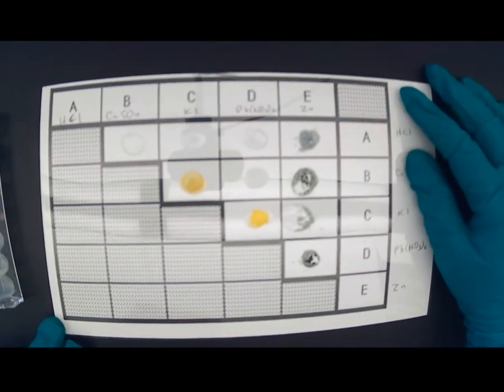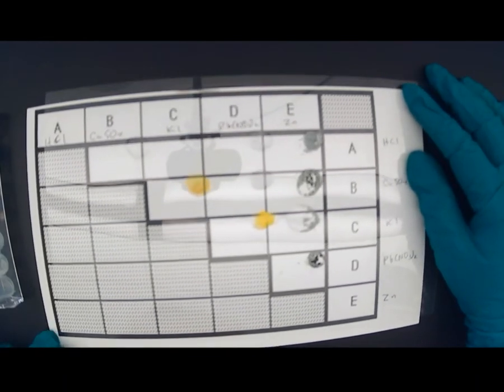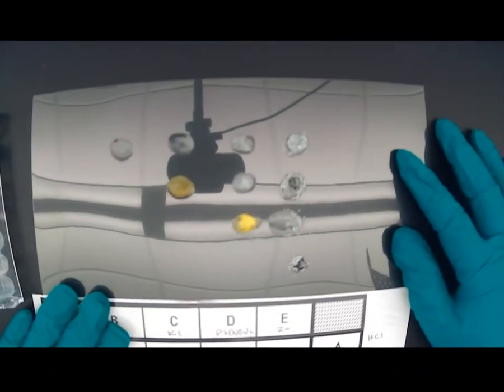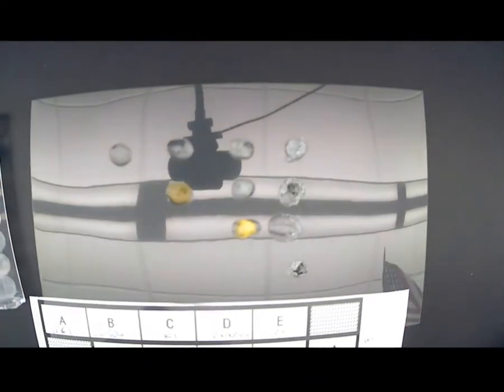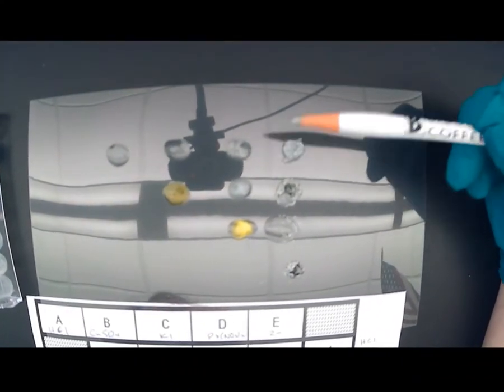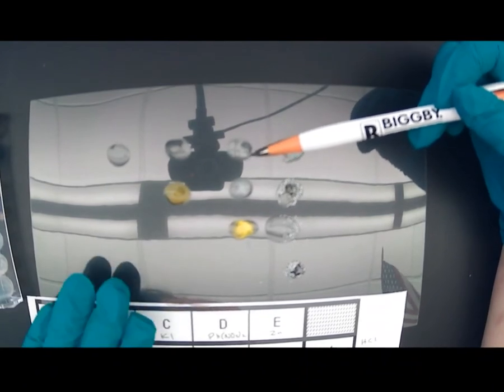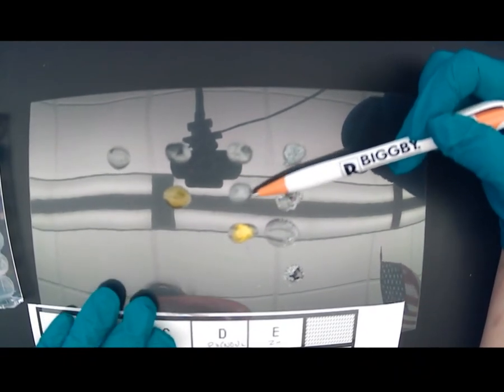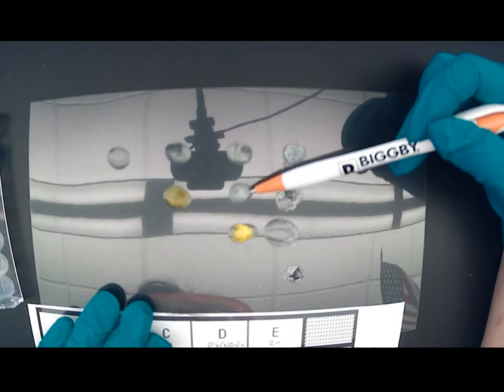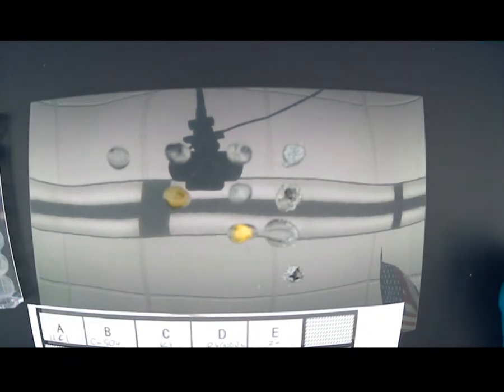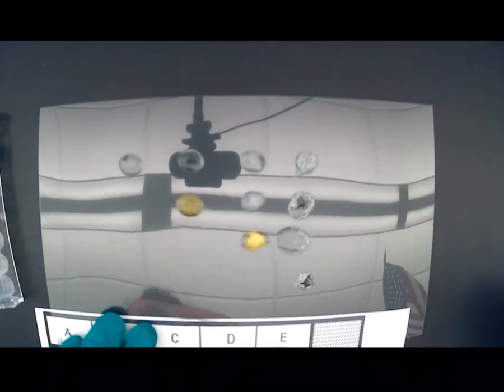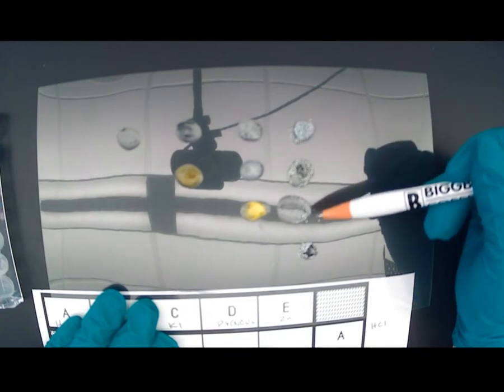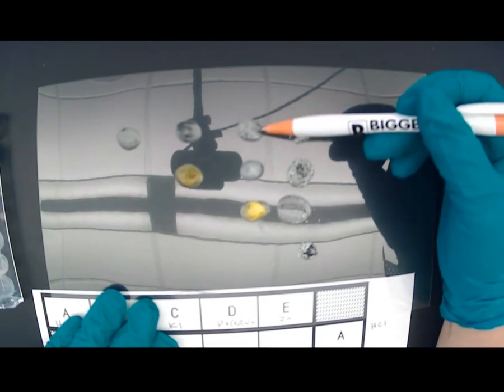Because these are on white paper, if there are any white things forming it's hard to see. Let me move this so you can see it against the black lab table. What I actually see inside here are little white crystals — that's what makes it look kind of cloudy white. And in this one it's kind of cloudy white, like a little milky white. This one I don't see much change. So I see chemical changes from the bubbles, this turned black, not much here, this turned black, and this one has white precipitate.